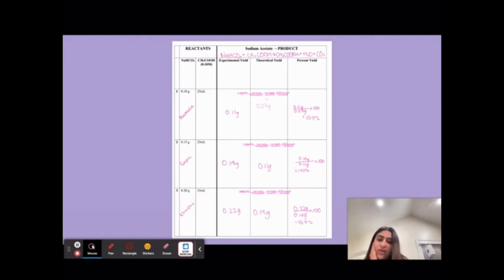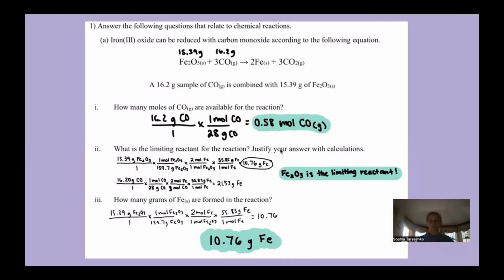So I guess you could say that our experiment could have been more accurate. Maybe we could have been more thorough about the sodium bicarbonate and it being poured into the beakers, but I think we did a pretty good job.